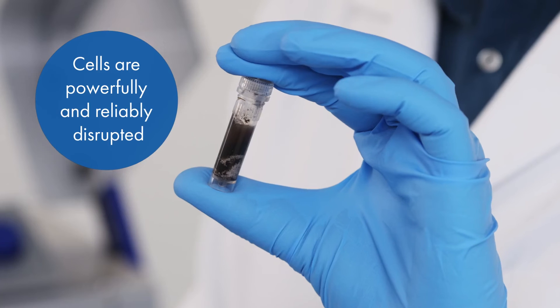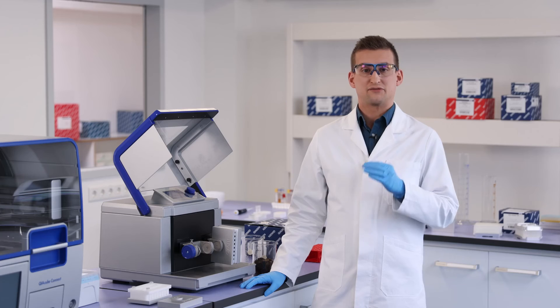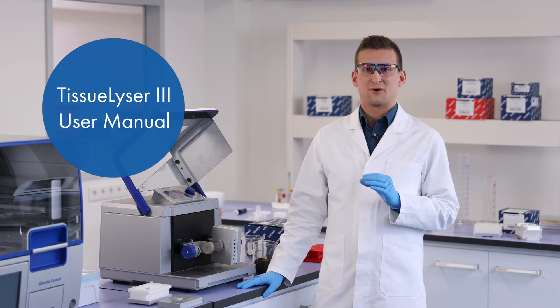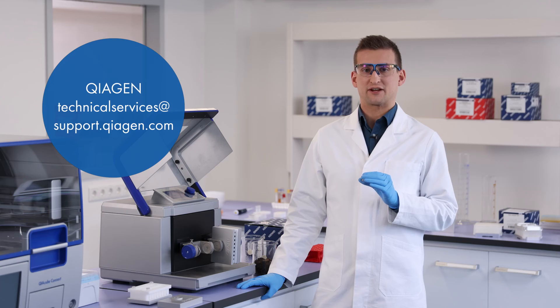And it's that simple. You are now well on your way to a successful lysis, thoroughly homogenized samples, and nucleic acid isolation. If you need support during any of these steps, download the TissueLyser III user manual or contact QIAGEN Technical Services at support.qiagen.com.